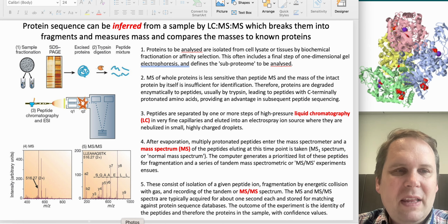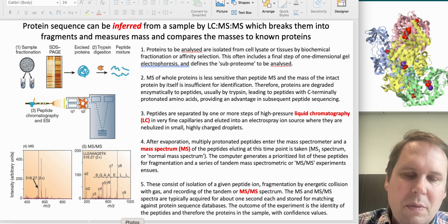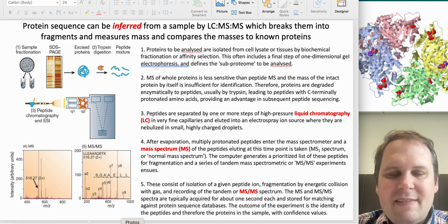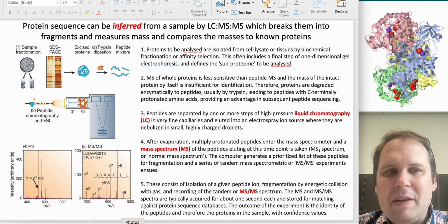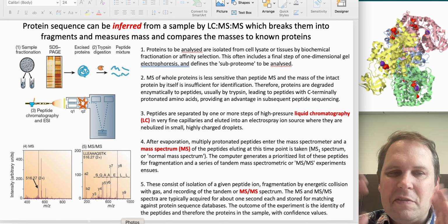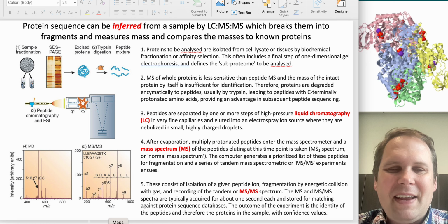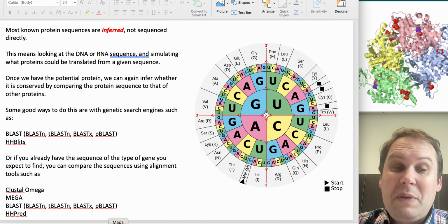Unfortunately, we can't really be any more direct than this. You can look for individual proteins, but each of those tests takes a while and a fair bit of money, and so people generally don't do that. They'll take the results from this with a grain of salt as being pretty good. Yeah. All right. But how do we actually do this?